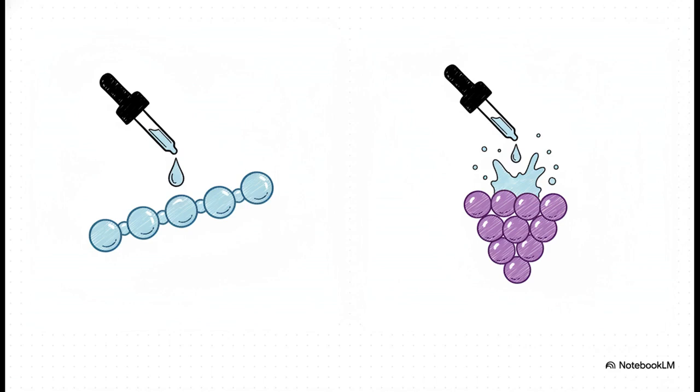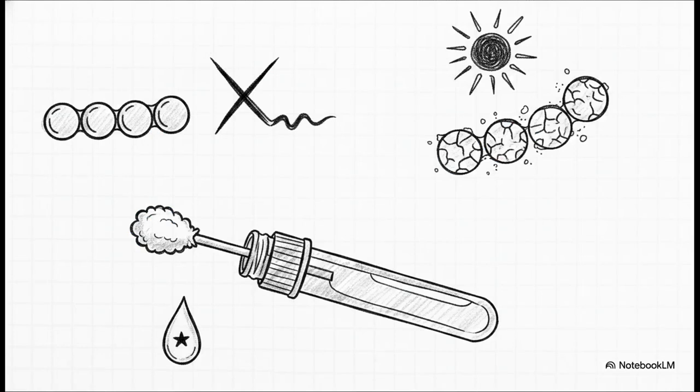But the ultimate separator? The catalase test. If you drop some hydrogen peroxide on them, Staphylococcus bubbles up immediately. It's catalase positive. Streptococcus? It does absolutely nothing. Strictly catalase negative. So, let's flesh out this profile a bit more.